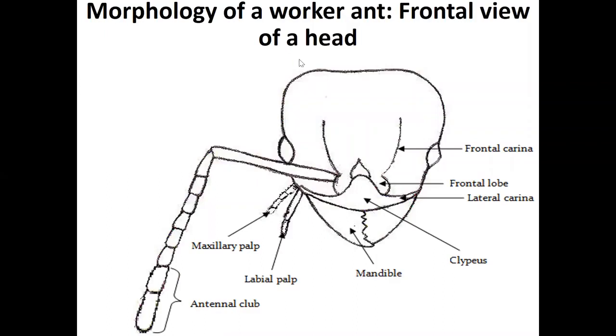Well, I would like to first describe the morphology of a worker ant. Usually in your day-to-day life, you see worker ants around you, right? So pick one and then you can follow the laboratory procedure I described here, and then you can identify to the subfamily level, if only you know the basic morphology of a worker ant.